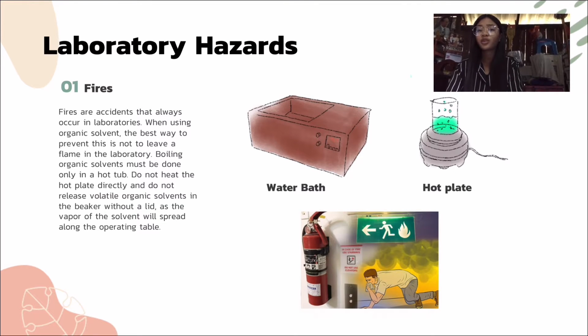Laboratory hazards. 1. Fire and explosion can occur in the laboratory. When using organic solvent, the best way to prevent this is not to leave a flame in the laboratory. Boiling organic solvent must be done only in a hot bath.